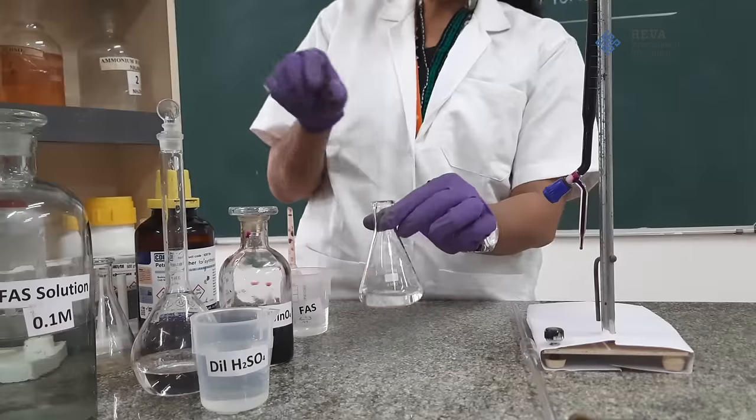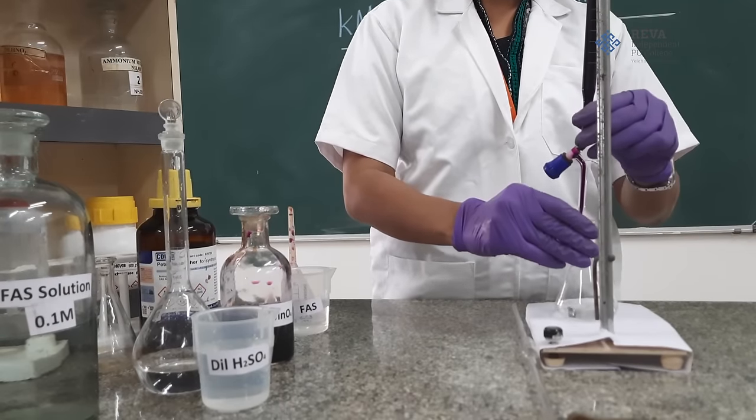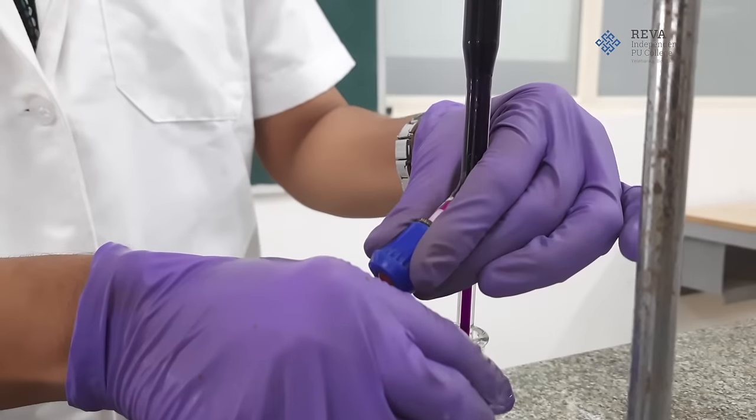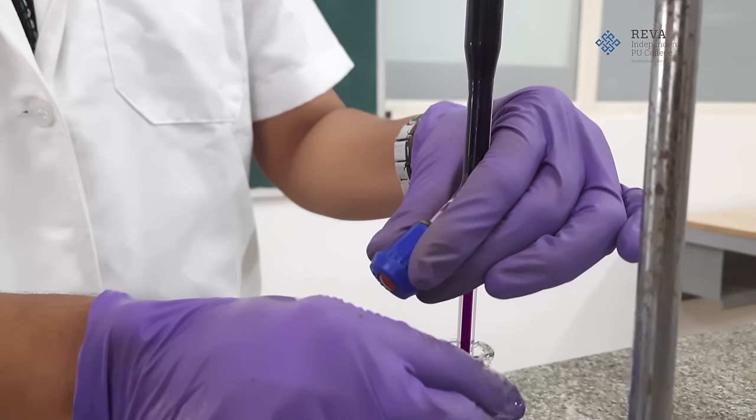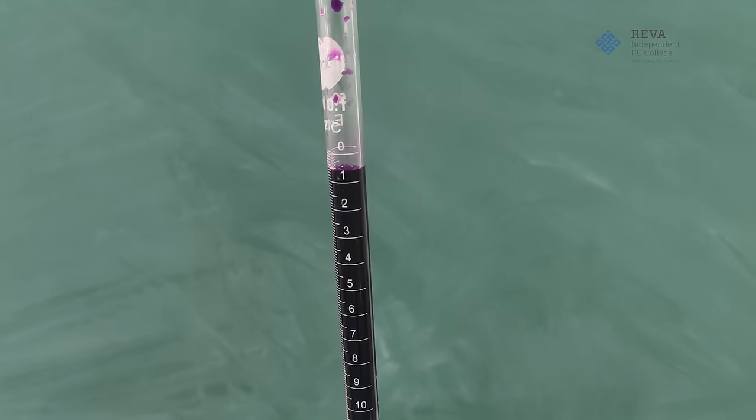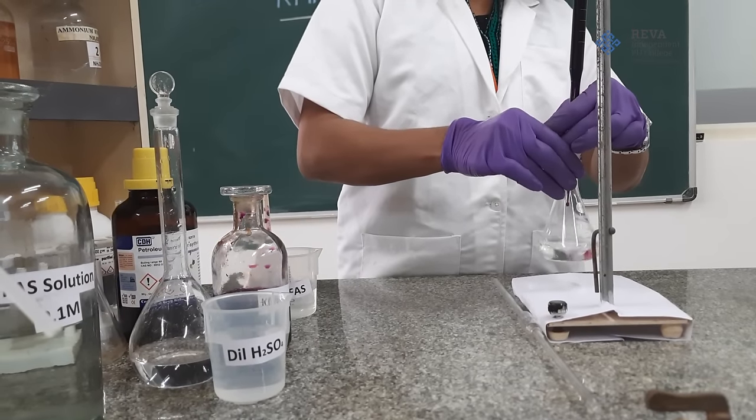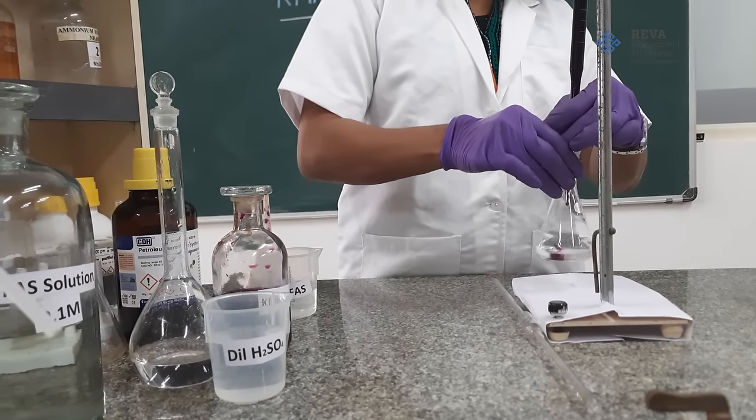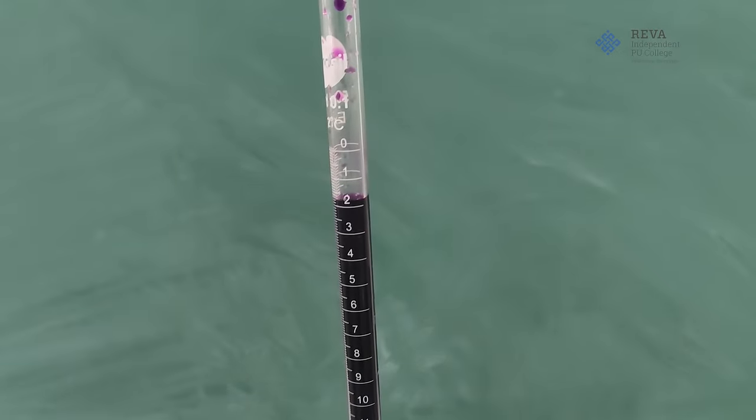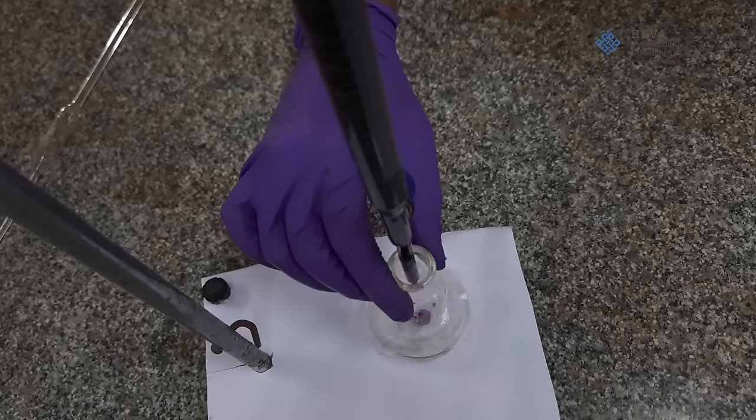Then while doing a titration, we should use a right hand for stirring the solution in conical flask and left hand is used to control the knob of a burette. Now we will run potassium permanganate solution from burette into conical flask containing ferrous ammonium sulfate solution and dilute sulfuric acid. Continue adding potassium permanganate into conical flask drop by drop with stirring.